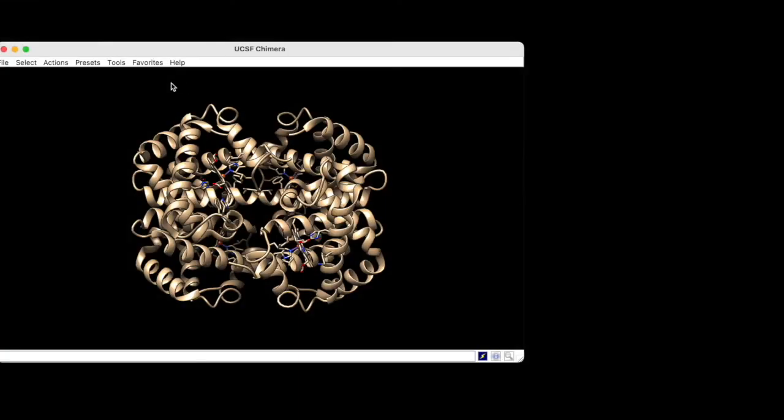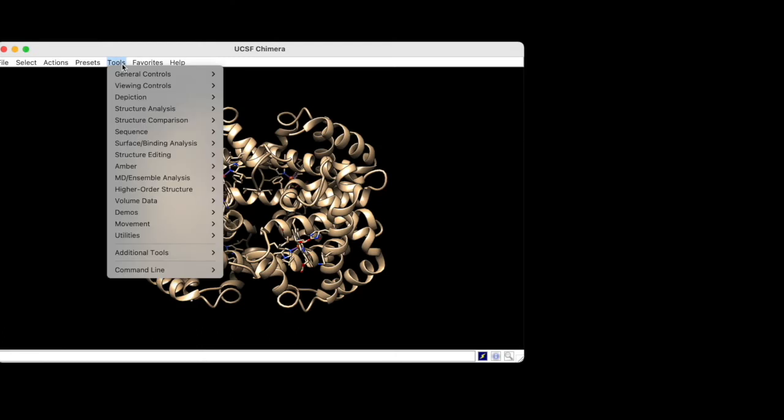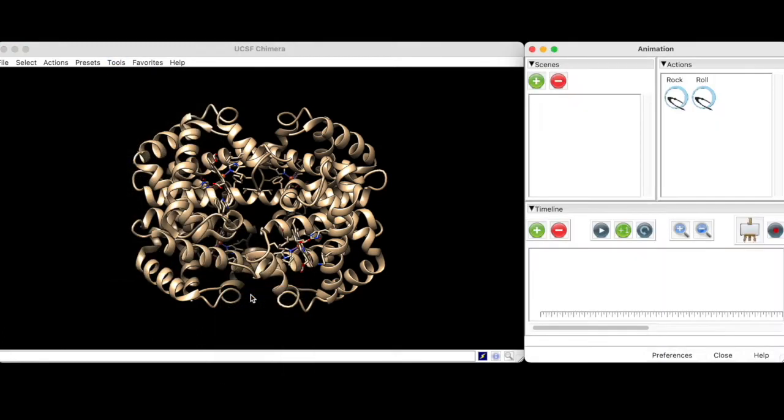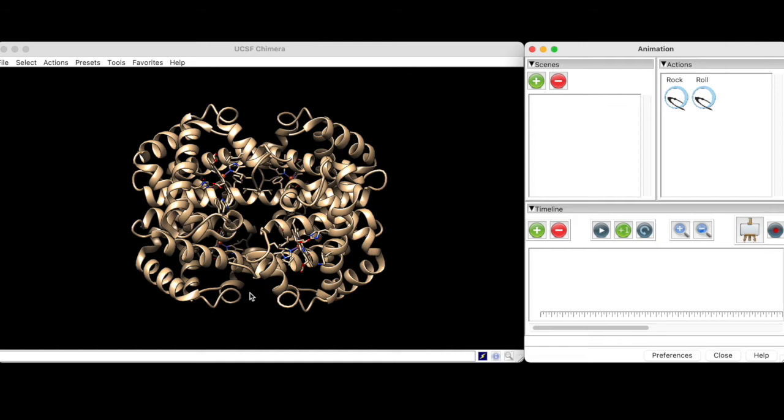Now we can go to Tools, Utilities, and Animation to access the animation interface. We will be using this interface to create snapshot scenes called keyframes, each containing a different depiction state of the structure. Once we arrange these keyframes in the timeline, Chimera will transition smoothly between them to create the animation.